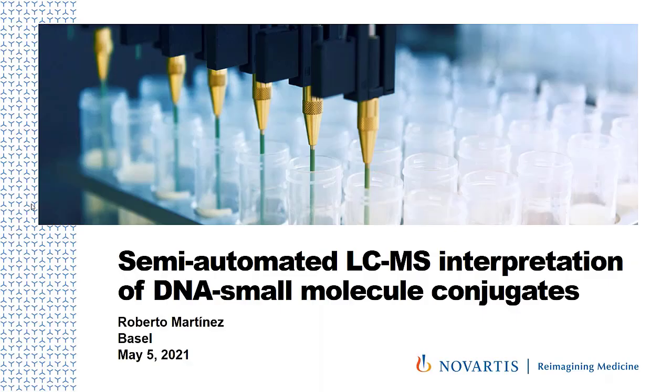So today it's my pleasure to introduce you to the QC Profiling plugin for Mgears, which enables semi-automatic interpretation of small molecule DNA conjugates or other macromolecules in a range of 6,000 to about 10,000 Dalton. This is, of course, just a short insight into the software, so I won't go through every single setting and button, but I will be happy to answer any of your questions at the end of the presentation as well as I can.